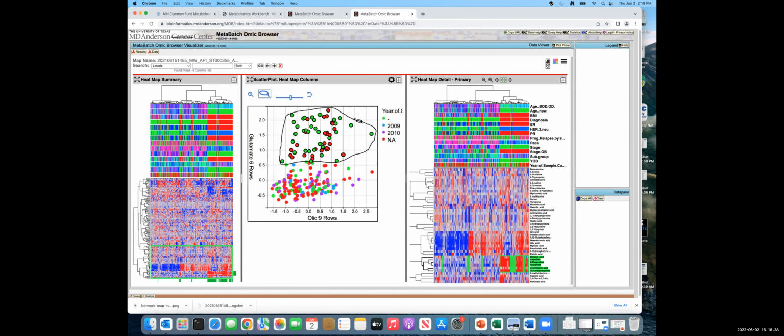And you'll notice that when I did that, not only were the points in the scatter plot selected, but also the same points were selected in the NGCHM, both in the summary view and in the detail view. And the browser works to maintain a single user visible view of what is the current selection across the NGCHM and all the plugins that are selected in it.